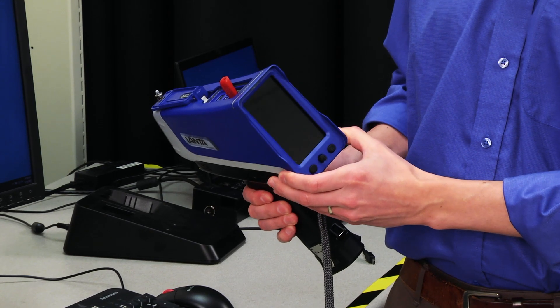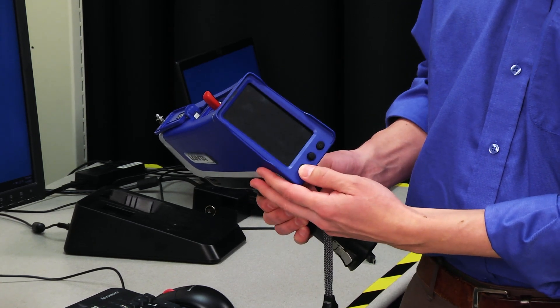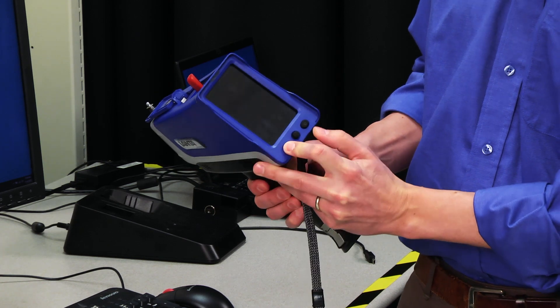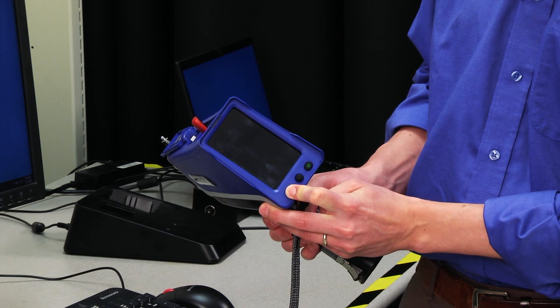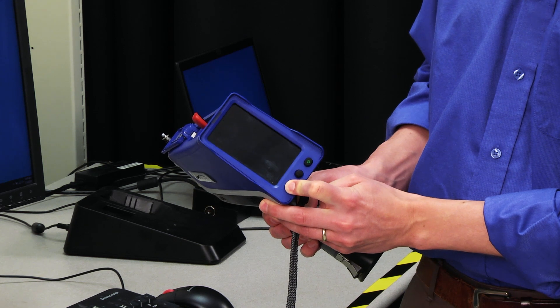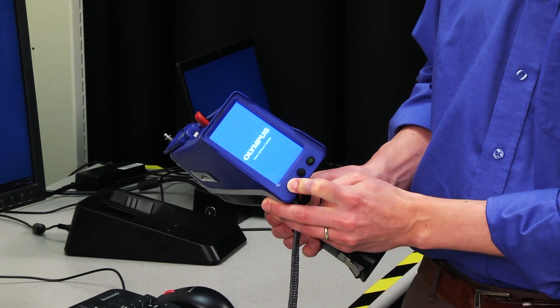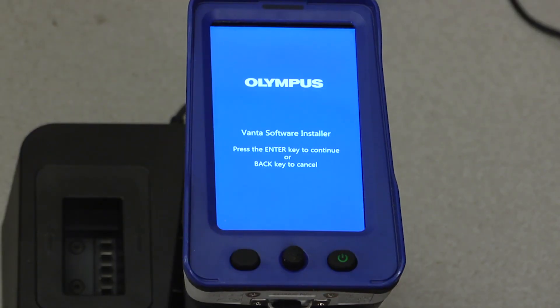Once the USB device is inserted in the instrument, hold the left button on the back of the instrument and turn the power on. Continue to hold the left button while turning the power on. As the instrument boots up, you will see the Olympus Vanta software installer screen display on the instrument. At this point, the software can now be installed on the instrument. Press the center key to begin the installation.